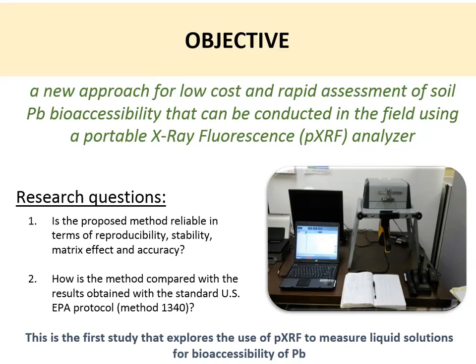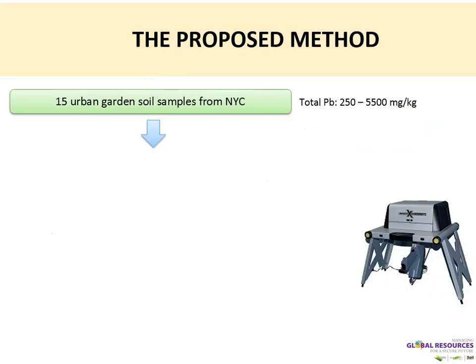Of course, there are some studies that try to measure other things, but for bioaccessible lead it's the first time. For our study, we developed a protocol. That's the proposed method, although it's not the only method that we did during our research, and I will tell you after what else we did.